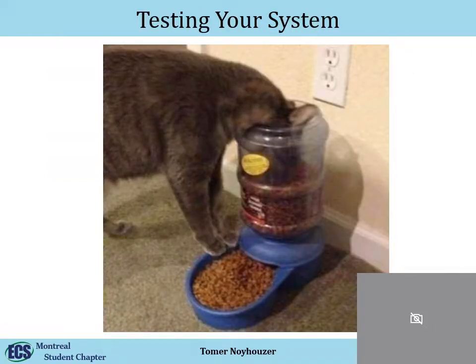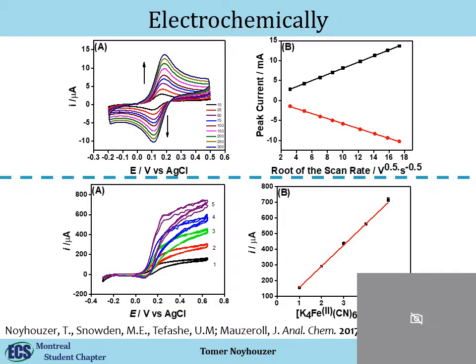Now, testing your system. So you already designed your system, you know everything works. You want to test your system because you want to be able to press that play button, go home to sleep, come back the next morning and have a ton of data to do analysis on, right? That's the dream. Or you want to know that your system can work without someone supervising it. So there's two types of tests.